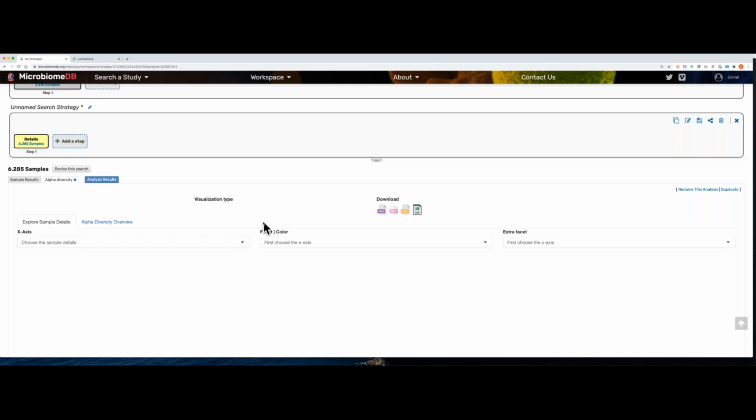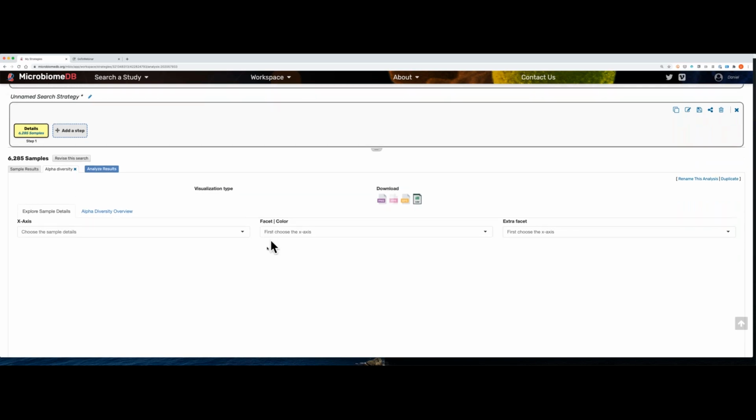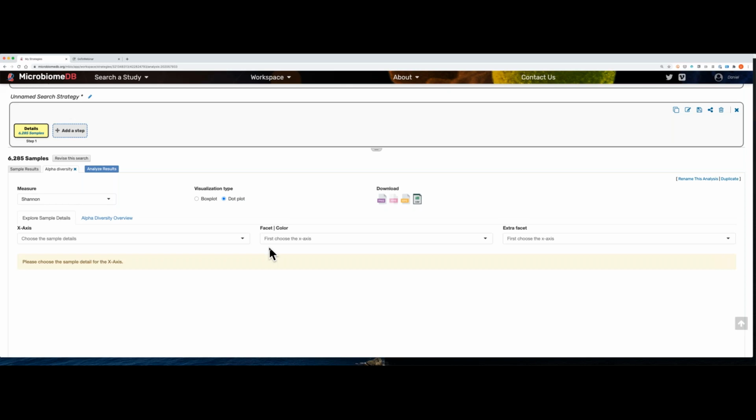Okay, so while this is loading, I'll just highlight that many of the data sets I am querying here, these longitudinal early life microbiome data sets from around the world, also have extensive clinical and epidemiological data available in one of the partner sites, also part of VEuPathDB, called ClinEpiDB. So if you're interested in clinical and epidemiological data, and less so in microbiome data, you could head over to ClinEpiDB. We are working on ways to connect the two sites so that you could draw from information on one site while being at the other.